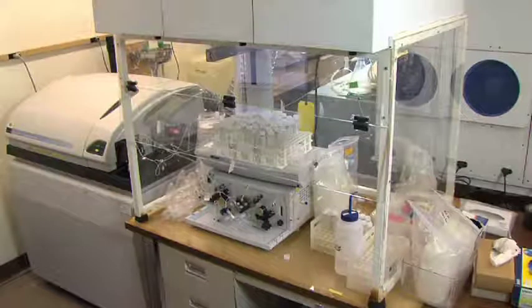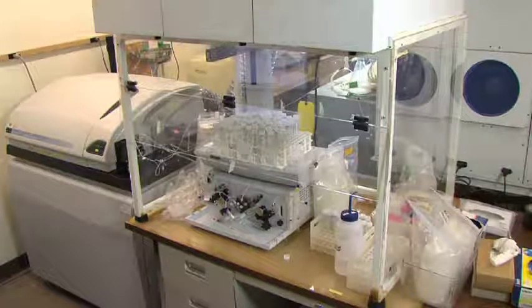Due to the nature of volatile organic compounds, the organic laboratory has a positive pressure air handling system. This helps to prevent cross-contamination from the other areas caused by the use of solvents such as methanol, acetone, and methylene chloride, which could be analytes of concern. The hazardous waste samples will go to the TCLP lab.